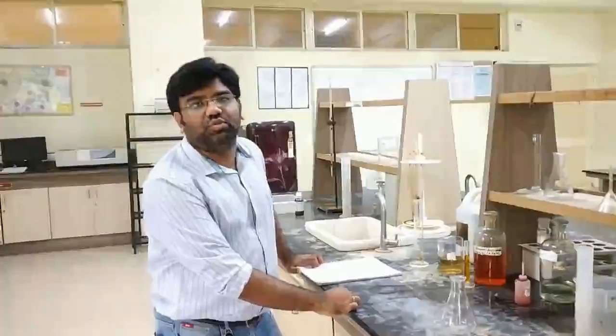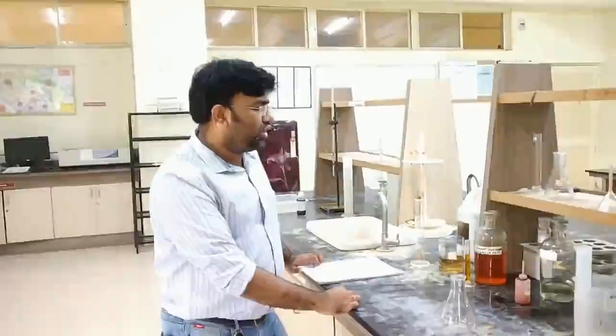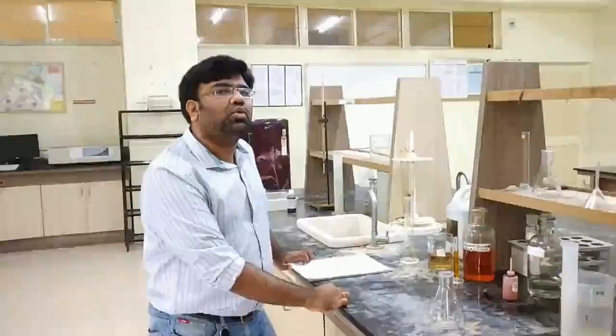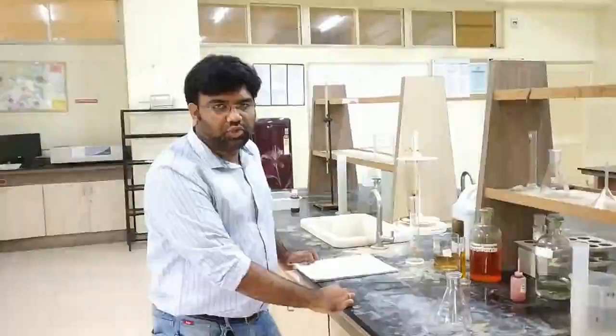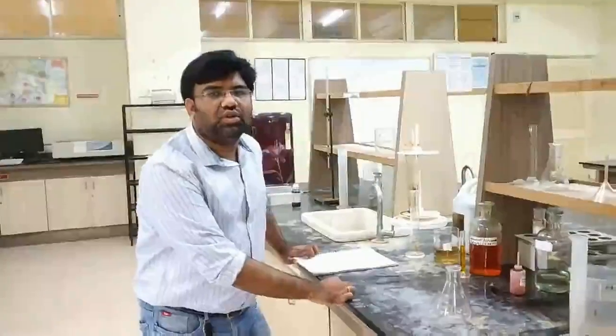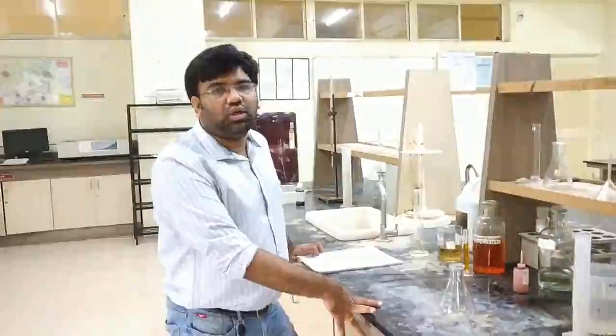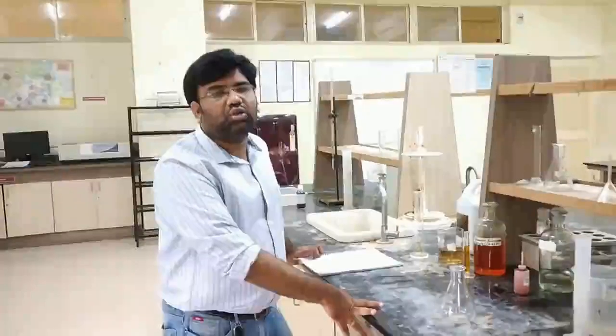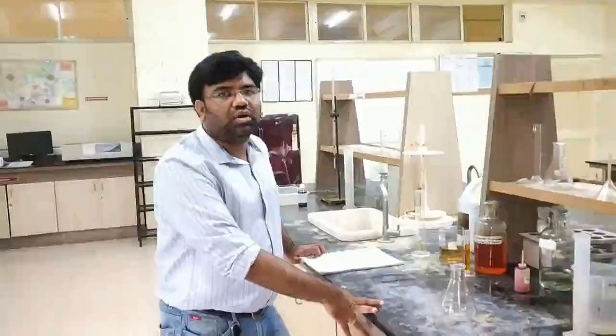for our COD experimentation. The solution prepared for FAS is 0.1 normal. So the 0.1 normal is required for the titration purpose. Here, after preparation, we are going to check whether we have prepared exactly 0.1 normal FAS, or whether there is some change because of our preparation or because of some climatic effect.